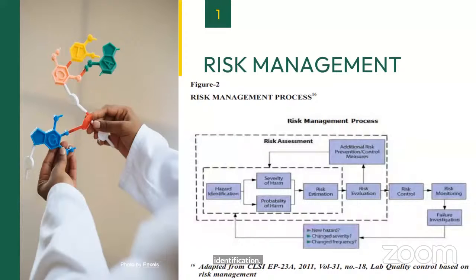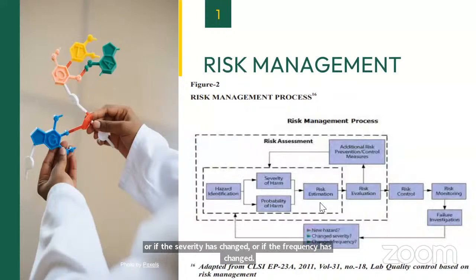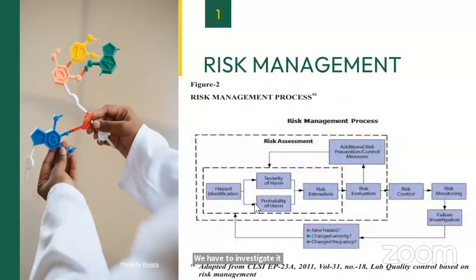If there are chances of any new hazard, or if the severity or the frequency has changed, you have to investigate appropriately and again start the complete cycle.